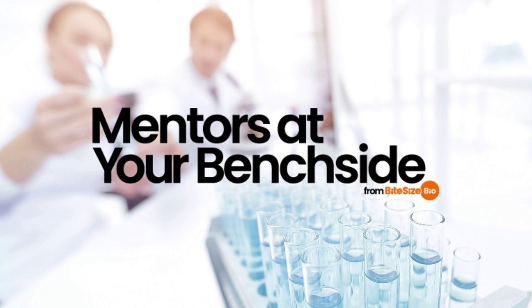Catch on it did, however, and it's not hard to see why. Visit the Electron Microscopy Databank and choose a year. I chose 2015 because it's recent, but before the Nobel Prize was awarded. Of the 640 depositions that year, 90 correspond to viruses, 40 correspond to cellular components, including parts of the flagellar motor, and 105 correspond to samples weighing more than 1 megadalton.